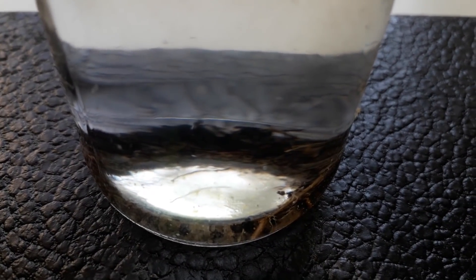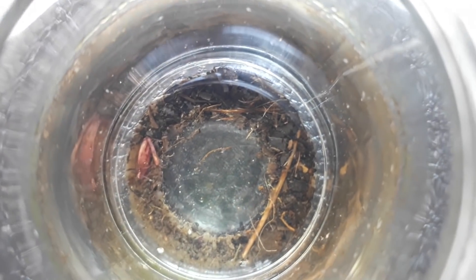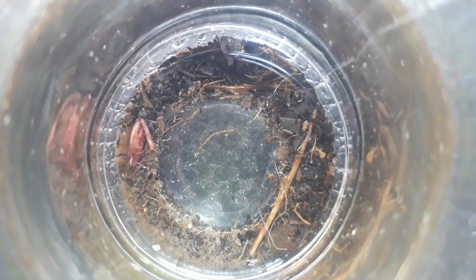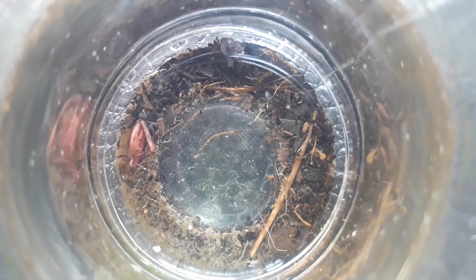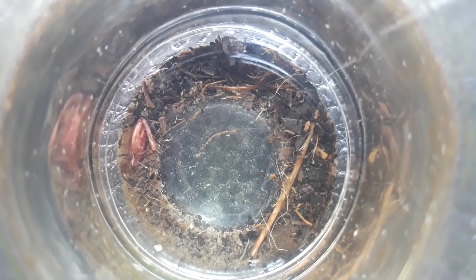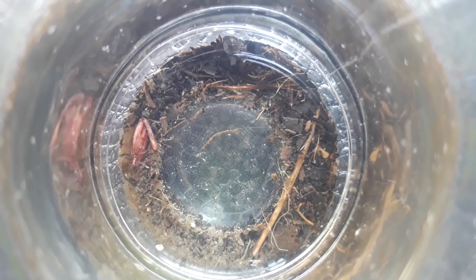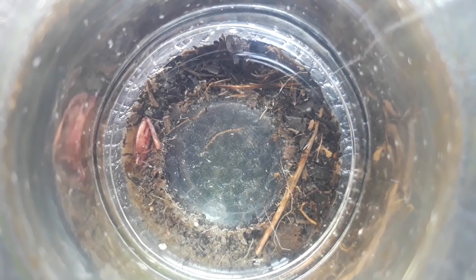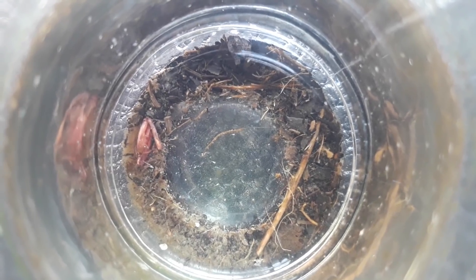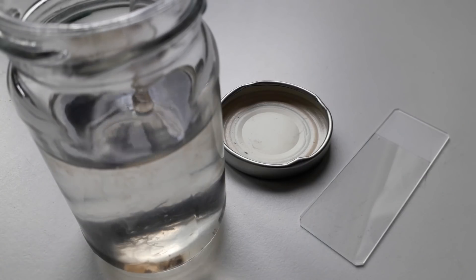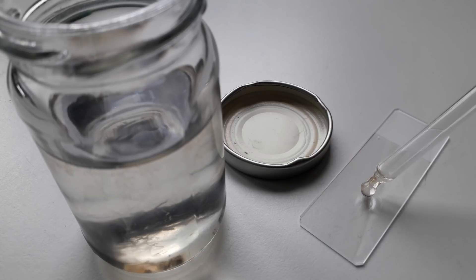Maybe you can see them actually swimming around. These are these tiny little crustaceans, crabs, water fleas and other daphnias and all of the other crustaceans that you find in freshwater. They're around a millimeter in length. So mostly they're eaten by fish, but basically they can also be used to clean the water because what they do is they actually eat all of the decaying material. So I took a little water sample with the hope of actually being able to catch one of these little crustaceans.